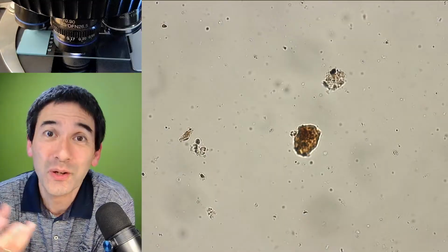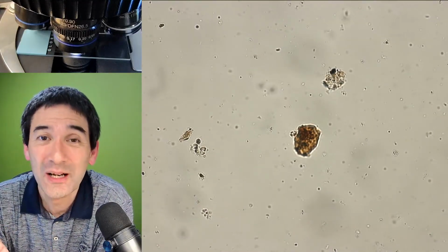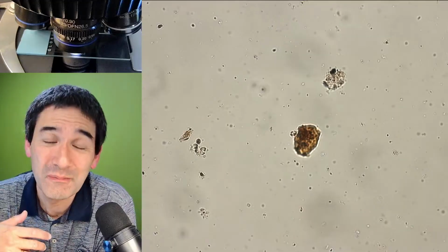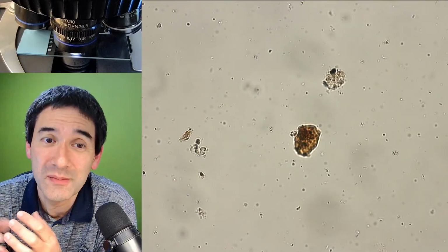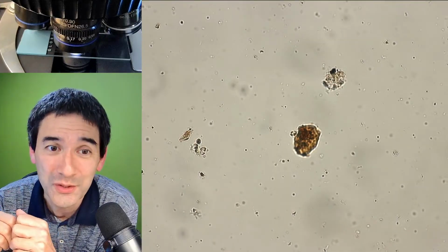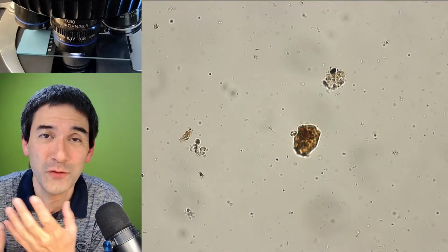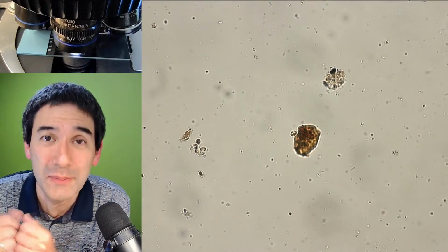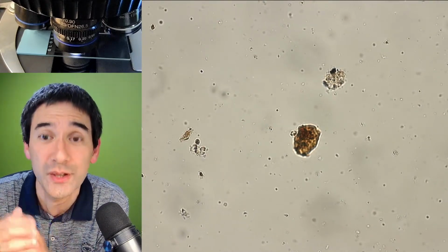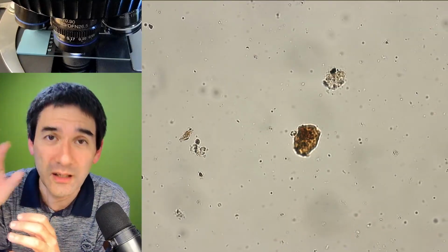Of course, they wanted to see some microbes. But there was nothing really interesting in there, because you don't have the same microorganisms like the huge, I don't know, paramecia, whatever, that you have in water samples. So in order to provide sufficiently interesting pictures, I actually enriched them so that I could show something to them, and then I could take the pictures.